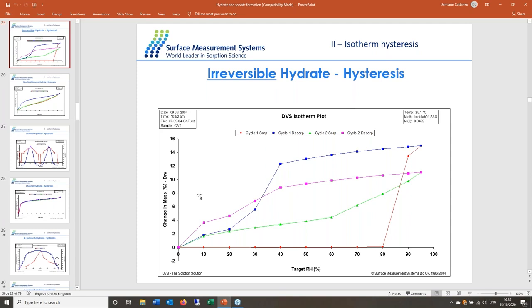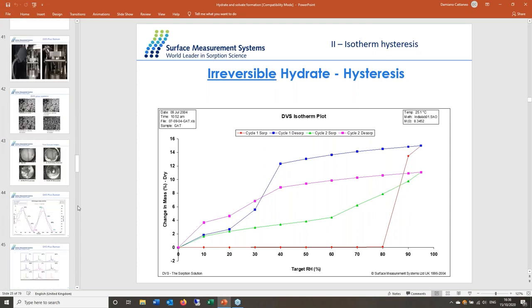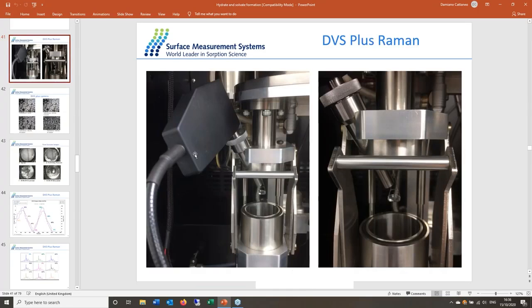So the Raman are collected on a quartz pan. So you see over here, we don't use a metal pan to run the Raman itself. We actually use a quartz pan to run all the experiments. So all the experiments that you see over here, now you can remove the background noise in the Raman collection. That's not a problem. But for these specific experiments, all the data that I show you today were collected using a quartz pan rather than a metal pan. So we don't have the issue.